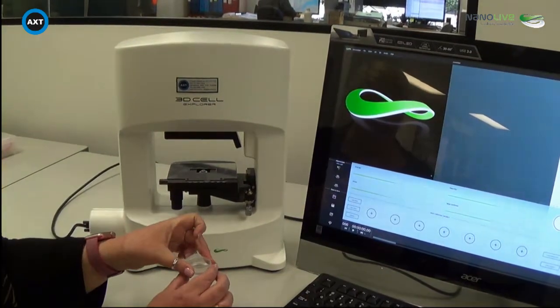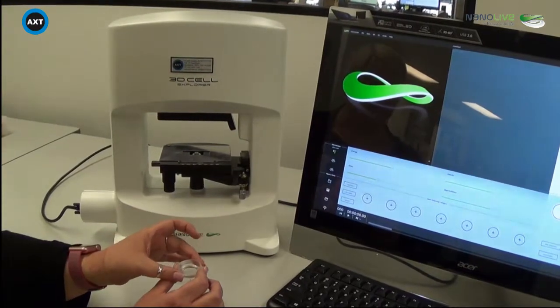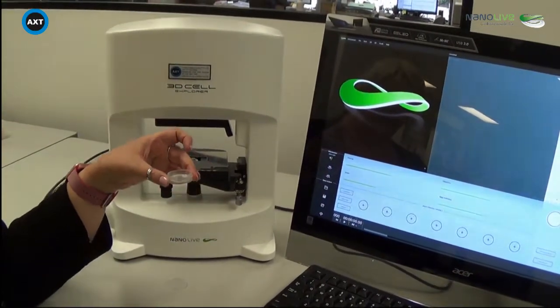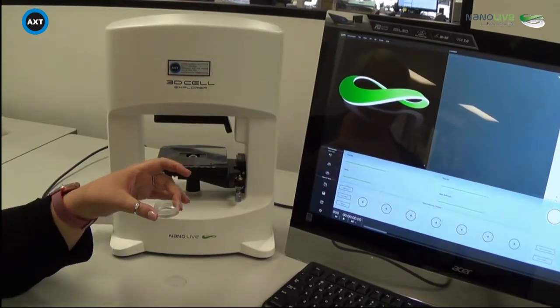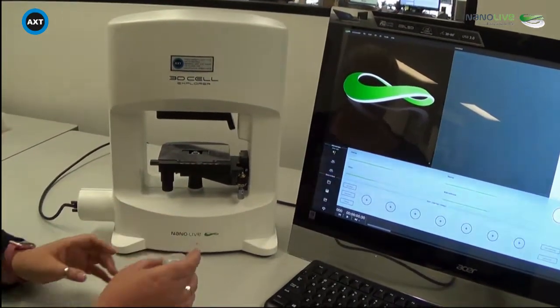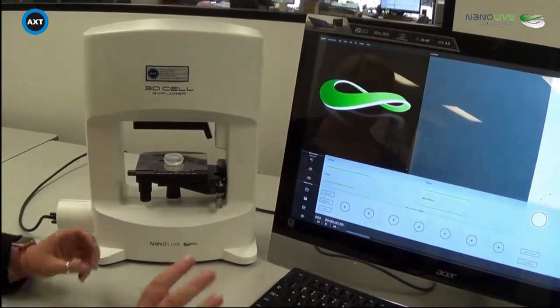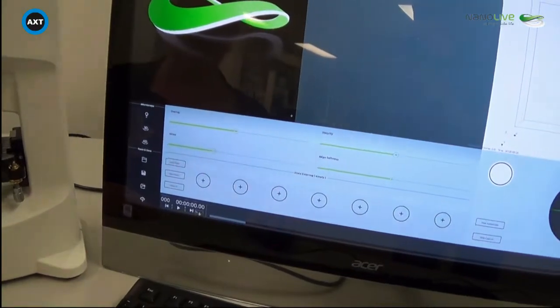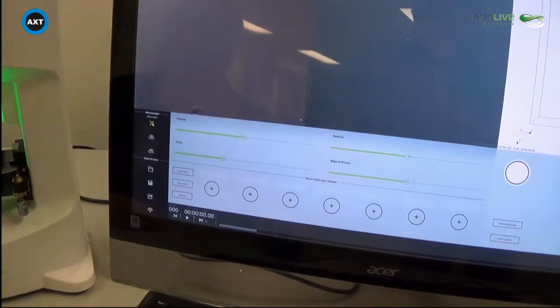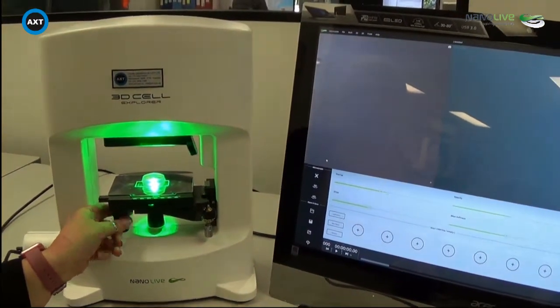I'm going to show you how simple it is to use. We take our sample, which is your cells, live cells, in a micro dish or you can also use fixed cells on a slide with a glass coverslip. All we do is place the cells onto the stage and then using the software, the software is called Steve, we are able to turn on the light source and then find our cells within the dish.